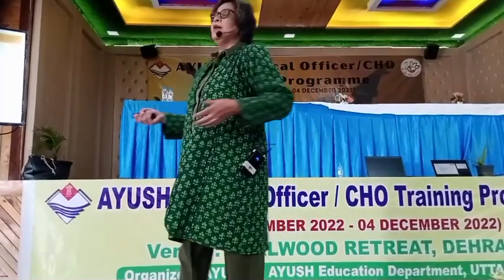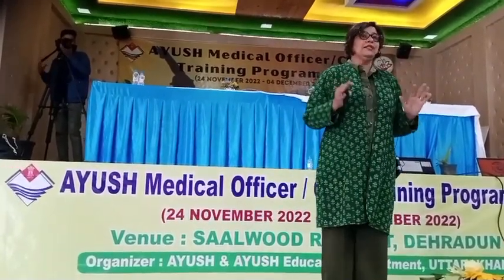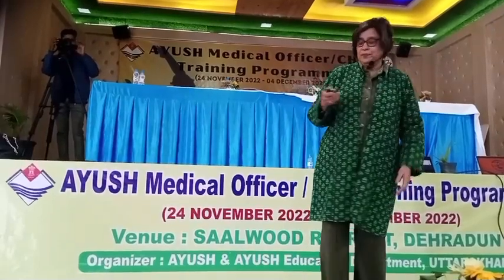Then bench cleaning and hypochlorite, this is for our own safety. We use hypochlorite because, even when you are touching patients, I think COVID has taught us that. Clean, wear gloves. That's one thing which we have understood as doctors, that we have to put our own safety first. We have to make sure that we are safe before we can treat the patient.